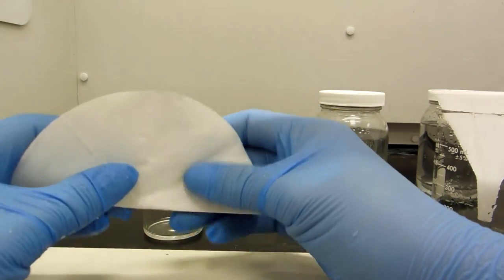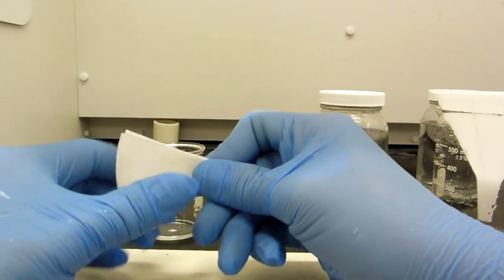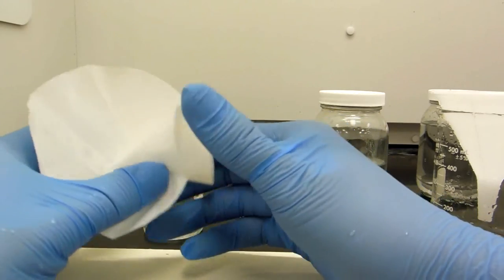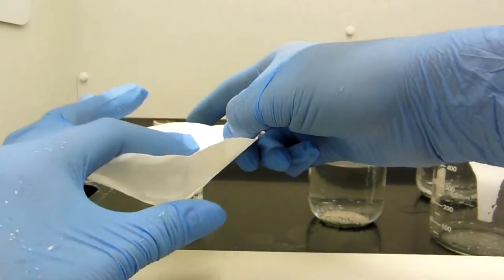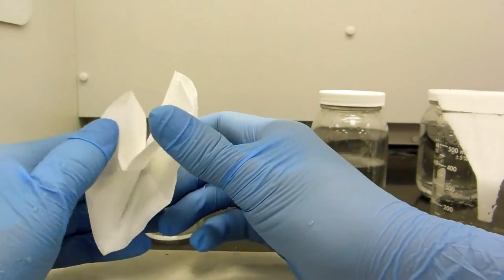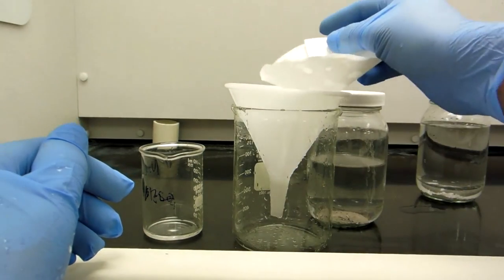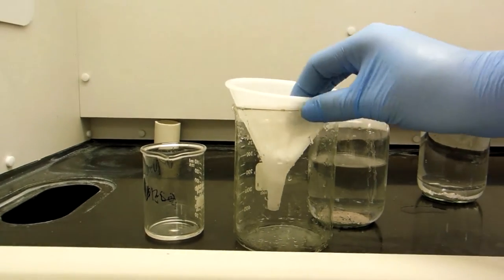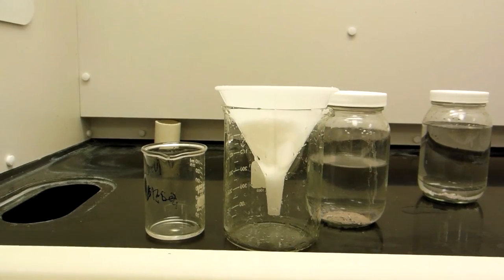I first fold in half to make a taco shape. And then I fold the filter paper again in half and once more, making sure to tightly crease the paper. I open up the paper and fold over only one section, leaving a cone shape suitable for fitting the funnel. So I just kind of make stronger creases to have that shape better. So moving the funnel to the center, I place the filter paper into the funnel and reshape it inside, as you can see. Once that's done, it is ready to accept the solution.